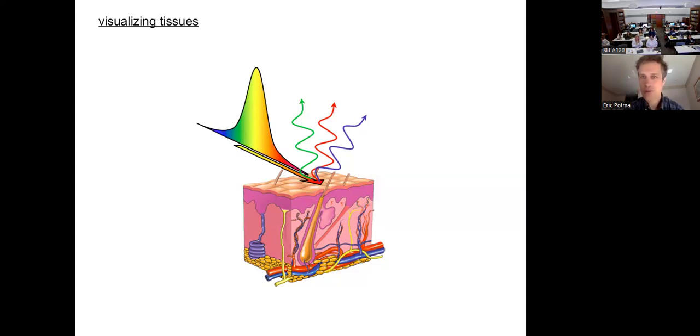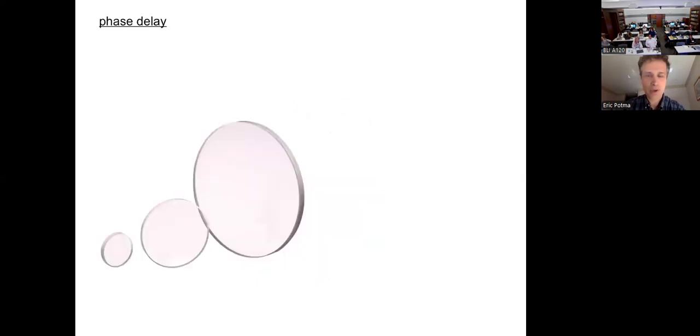And so we'd like to do that with light. Light, of course, is a great tool. In the most ideal situation, what you'd like to do is send the light in and get the light out, and the light that comes out tells you a story about what's going on inside. Ideally, you don't perturb the tissue or cells that you're investigating. So it becomes a non-invasive or completely non-perturbative kind of probing approach. And it's extremely powerful, and I guess this is why you guys are here at this course. So there's a whole bunch of ways to do that.